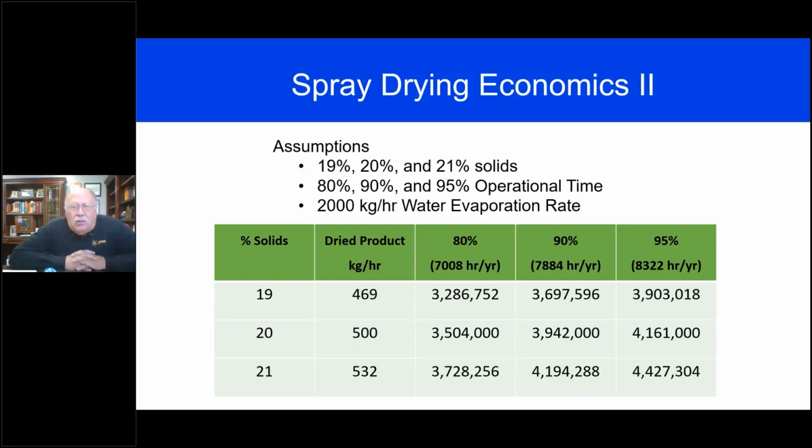The point of me talking about this, and for all of this prelim, is to really say that the way we try to control how we're maximizing our throughput, and maximizing the specific aspects of the product that we're getting, is by characterization.